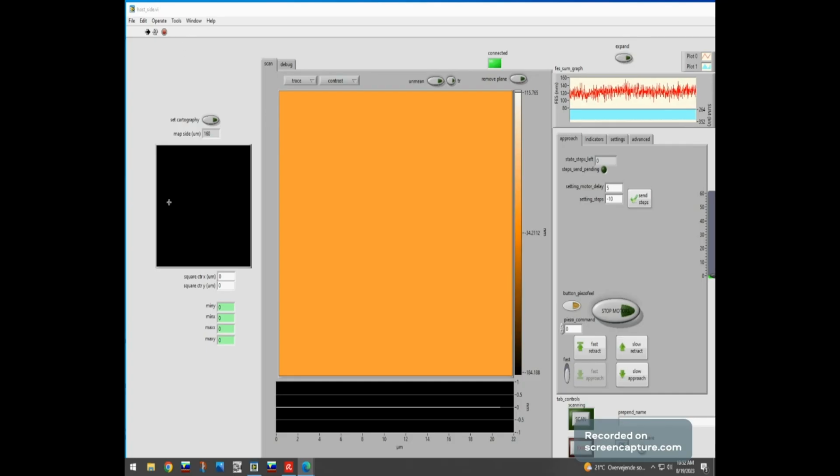On my right screen, I open the program shortly after I have connected the MyRio and it's connected. Then you can shortly see that it will be connected as a green square, and you will get a signal as we see here, and then we can get started. This is our front page of the program.